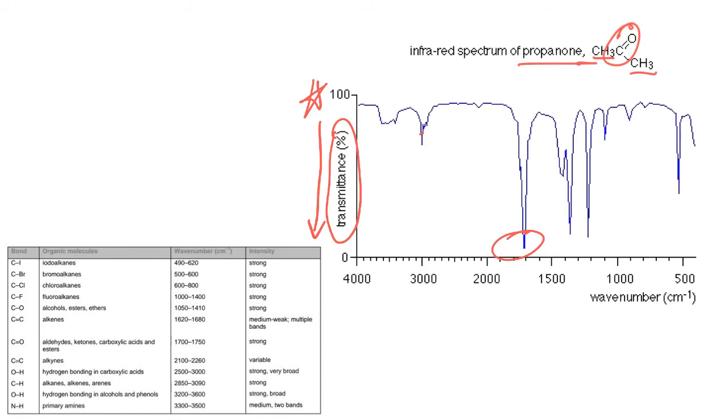So we call that a peak, or say that it is a very, very strong band. So you see lots of bands in these as well, and you don't have to interpret every single one. What's important is that if you're given the structure information, it's really just about explaining what band corresponds to what part of that structure.